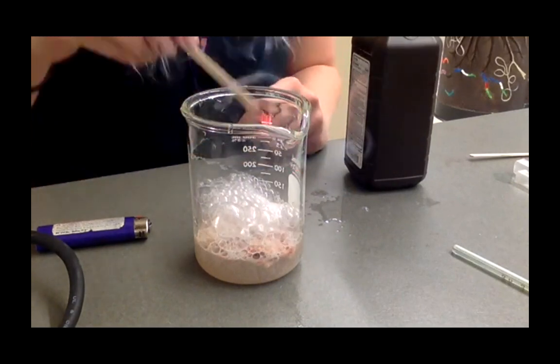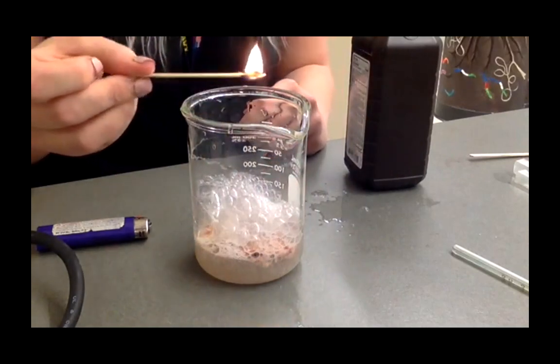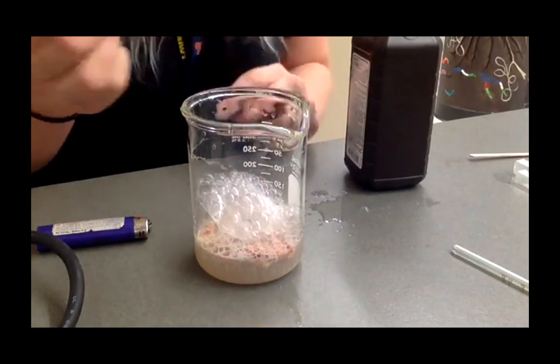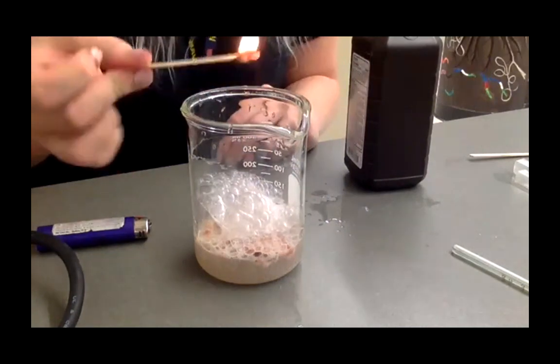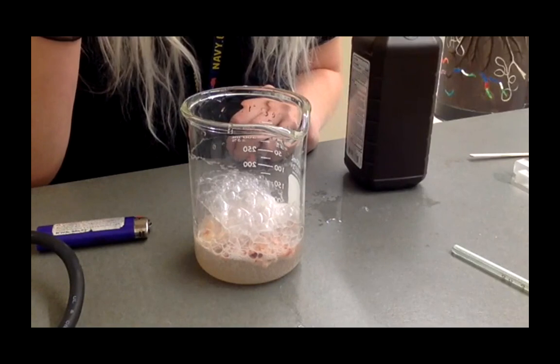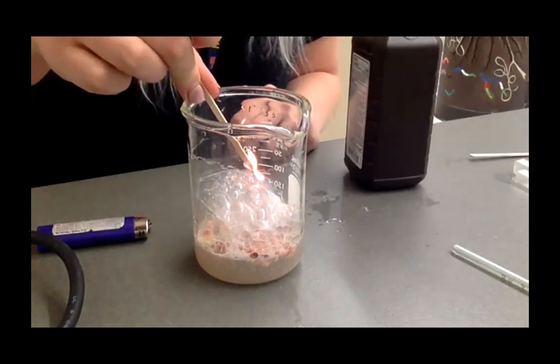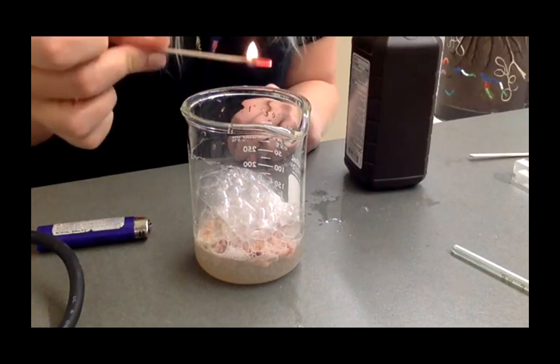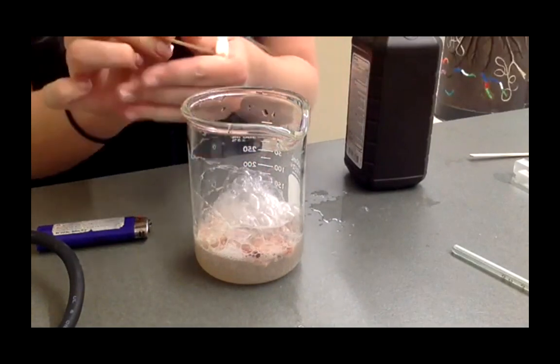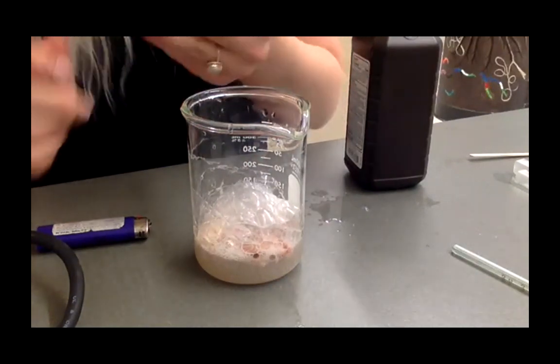Another ember. Oh, I'm so good at it this year. Yay. Caught on fire again, right? That oxygen is fueling that ember to re-catch on fire. Can you guys see that okay at home? I hope so.